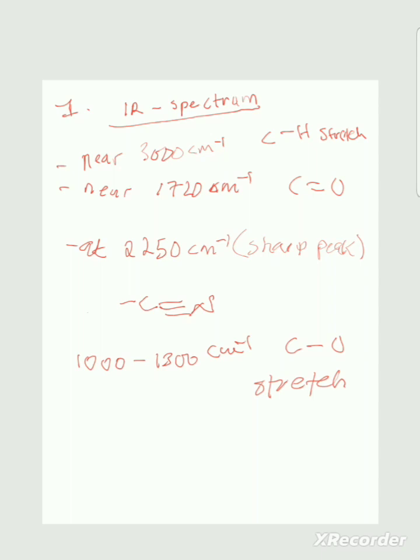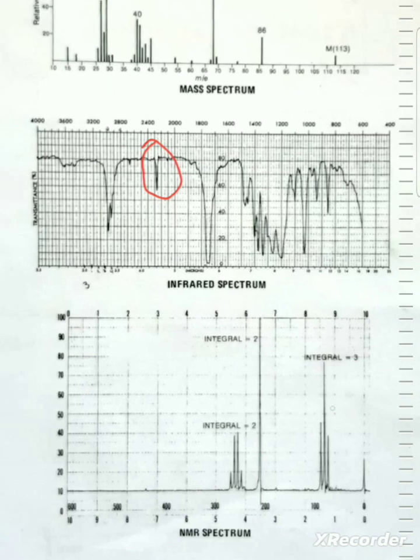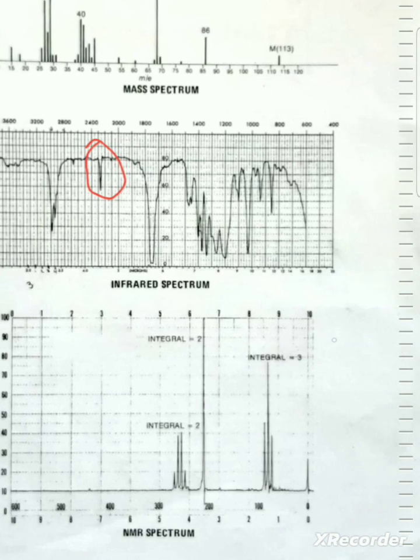So let me try to go on to NMR. This now will help me to connect on the NMR, and when it comes to mass, we're going to confirm that. All right, let's look at the NMR. You can see these are the peaks that are here, and the chemical shift is presented in ppm. These signal peaks are determined by the n+1 rule. The integral in this case is defined as the number of hydrogens. So when we say integral here, we're going to say CH3.